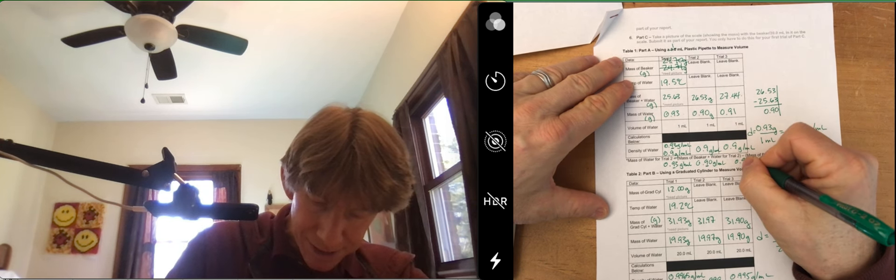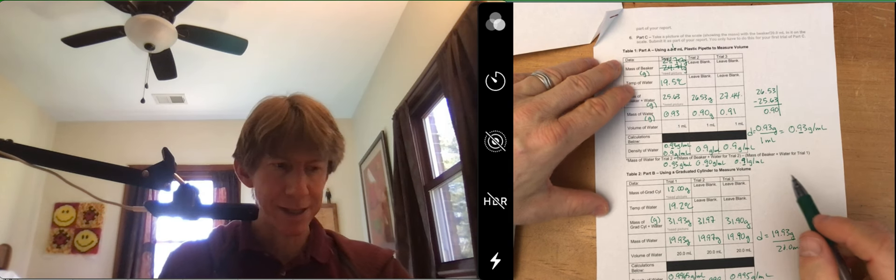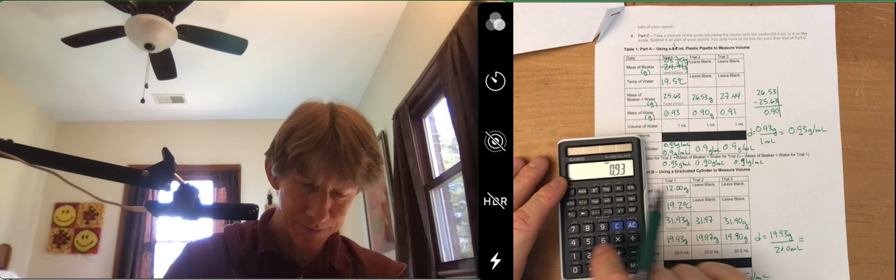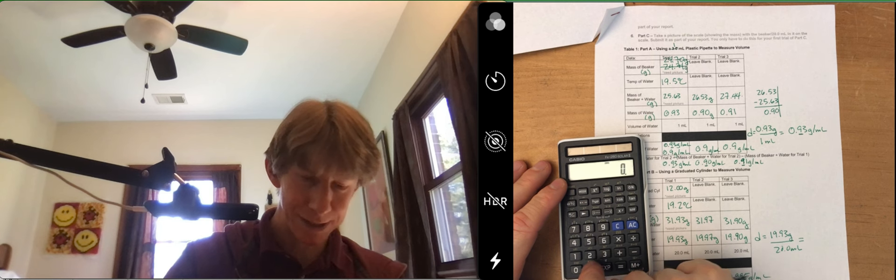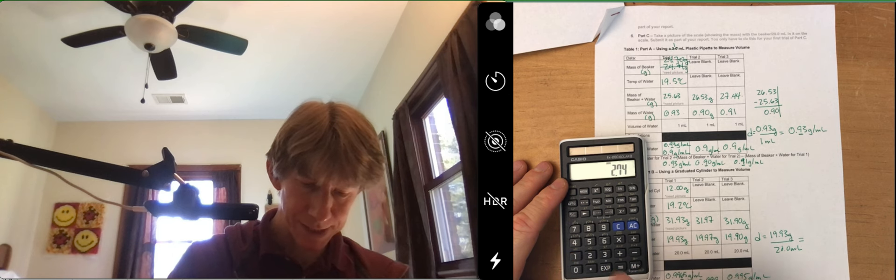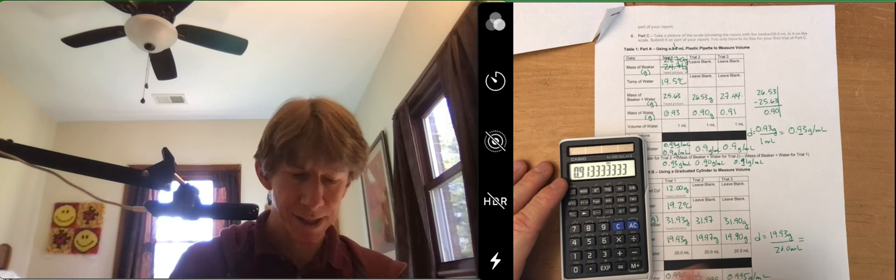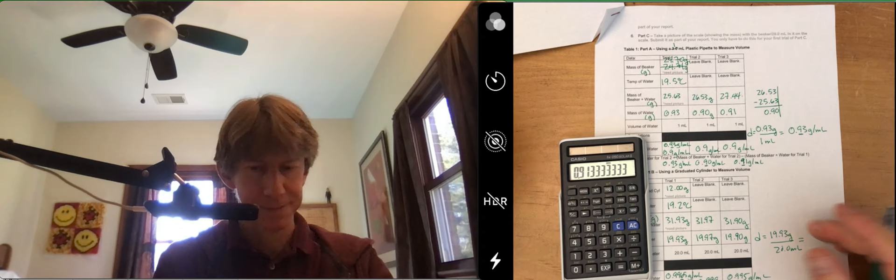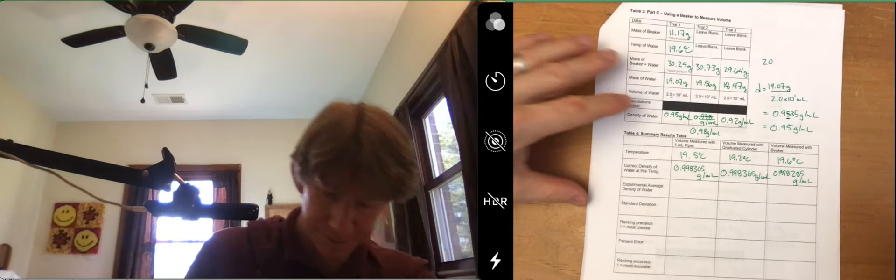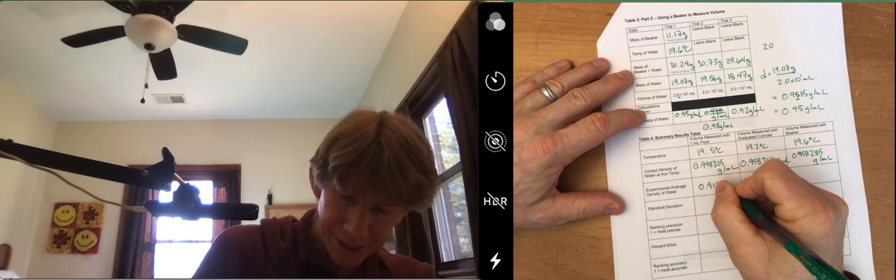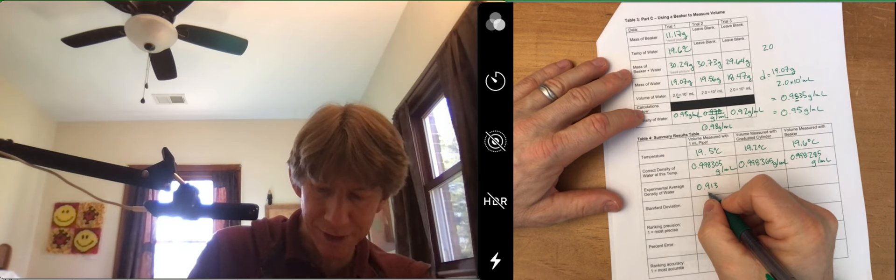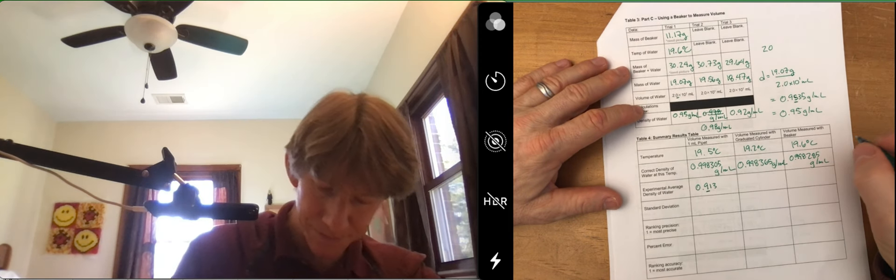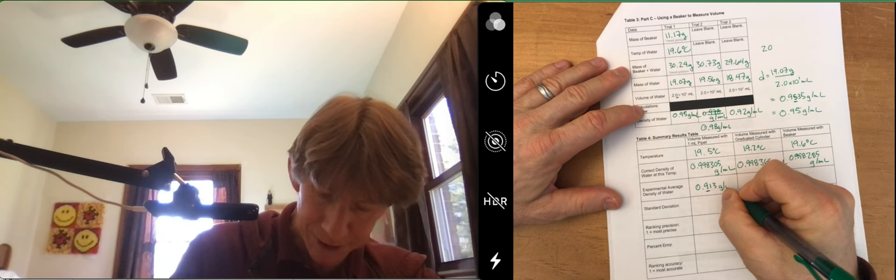That's a nine. So now to take the average, it's going to be 0.93 plus 0.9 plus 0.91. I get 0.91333333. And I will just keep three sig figs there, still underlining the first one. And that's grams per milliliter.